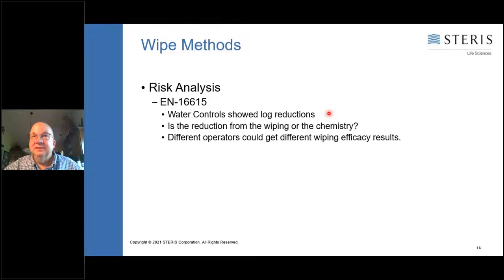And you can get very different results. So if you had Uday, Richard, Dan, and myself all do the wipe study, you could get four different results with that wipe study. And that's not a good thing, really.